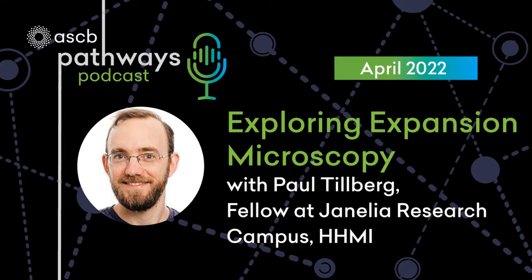Yeah, this was the part that really kind of made me stumble when I was trying to wrap my head around this, because I just felt like, how can you be sure that the expansion is uniform? How can you be sure that you're maintaining the same spatial arrangement of everything in the tissue or the cell or whatever it is that you're looking at? How can you know for certain, because even the universe doesn't expand at the same rate, right? That's right. So how do you know?